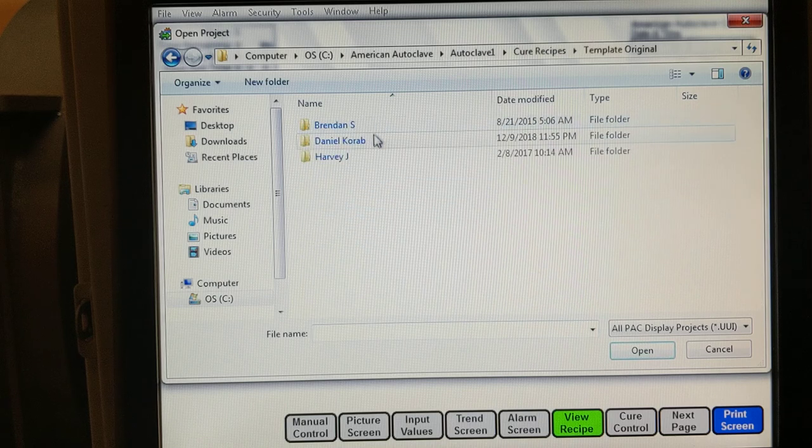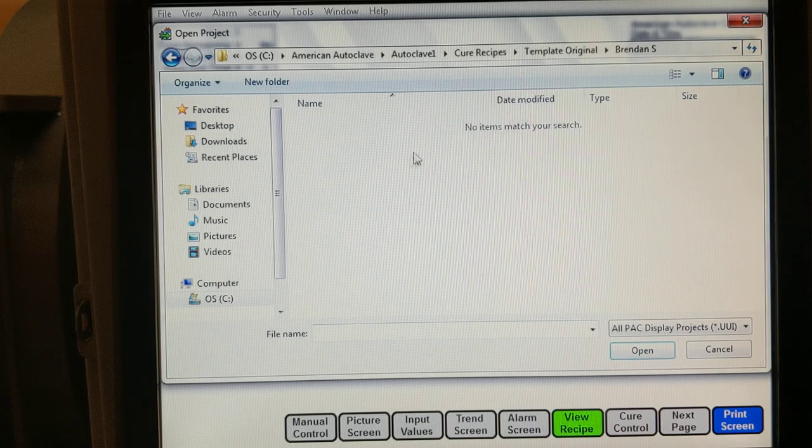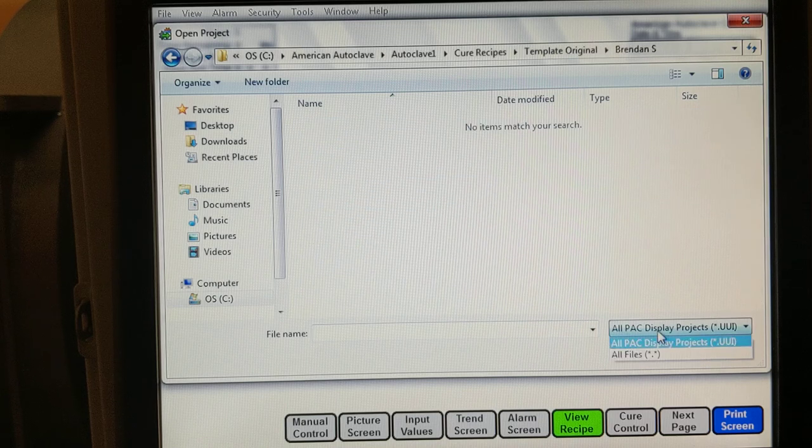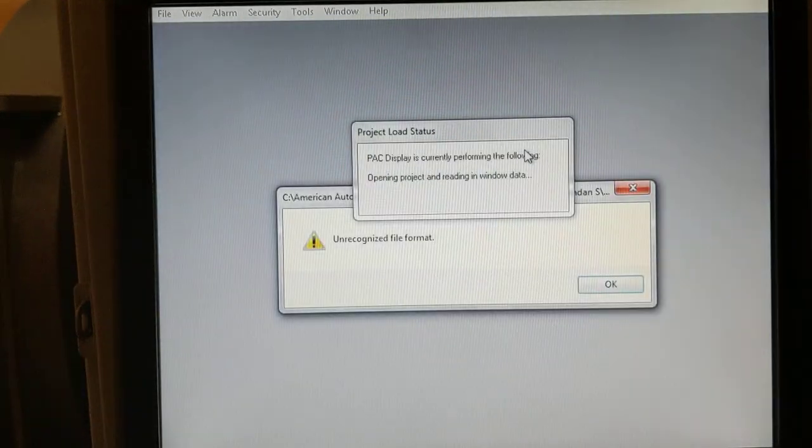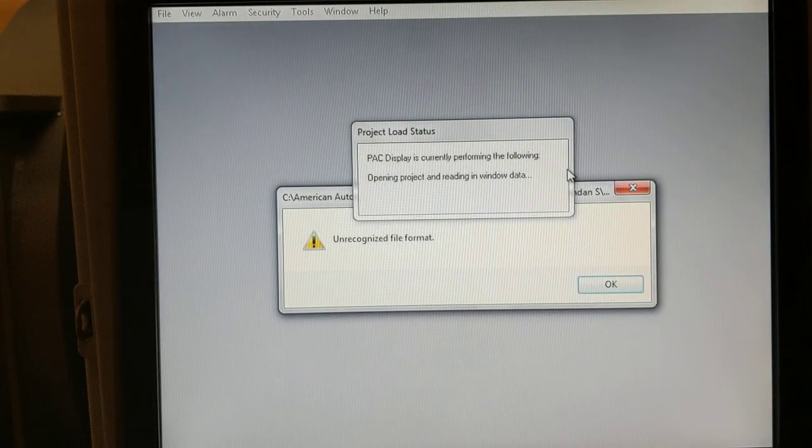I'll show you what happens. I'm trying to open the same thing. We end up with an error message, and the interface is gone.